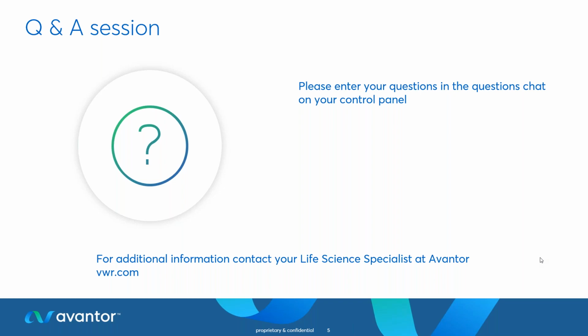Do you have a recommendation for eliminating rat DNA? I'm not sure if I've ever come across that specifically, but we can dig into that a little bit more. We can send you the human host depletion DNA protocol that our customer has done, and maybe that can also be tailored and used towards rat DNA. Yes, there will be a CRISPR-Cas9 V14 kit.